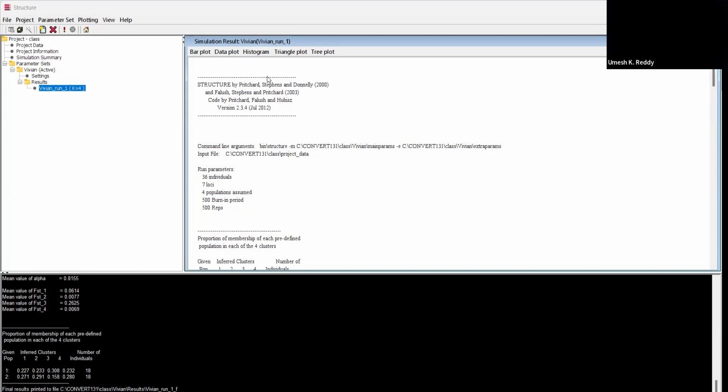So this is how it is distributed. For the various lineages, say lineage 1, how FST is distributed, for lineage 2 FST, lineage 3 FST. So this is how you can see lineage-wise population differentiation.